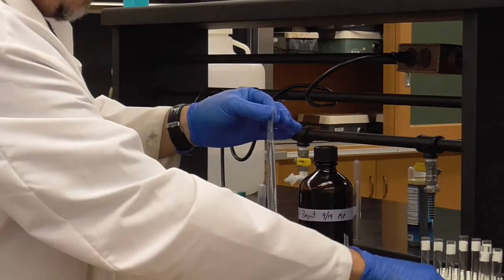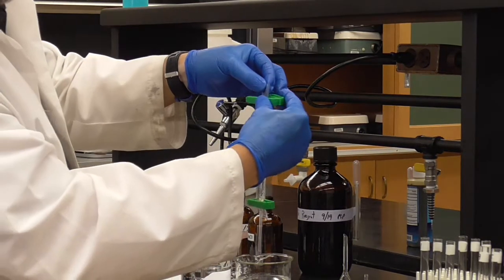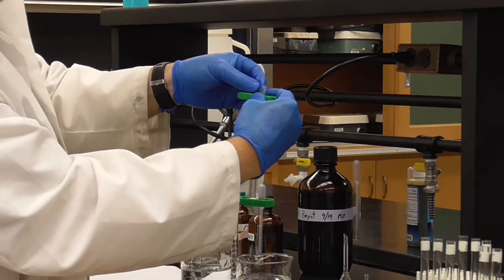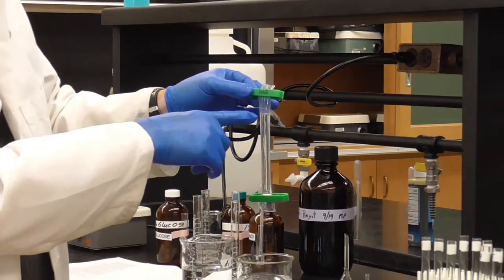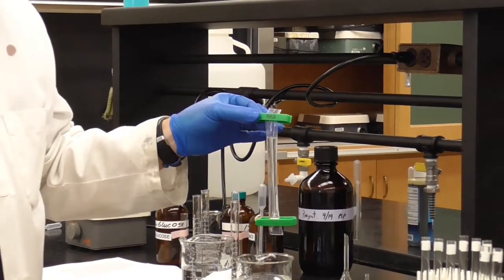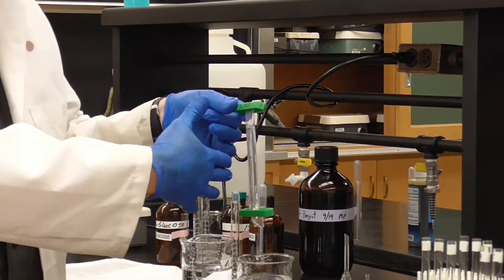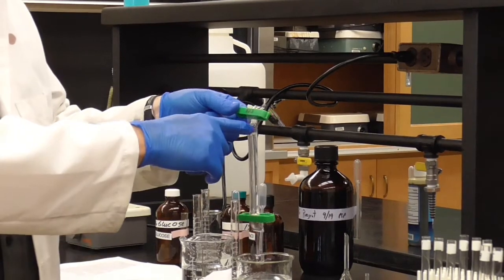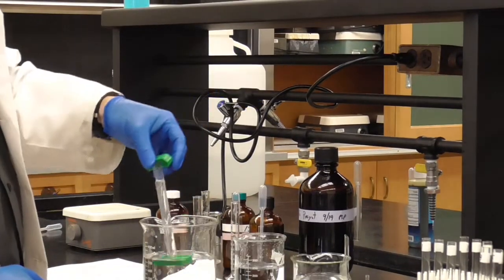All right, our second clip, I'm going to take it and put it near the top and clip it on. So there we go. Now we've got both the top and the bottom sealed. Notice I didn't put it right there at the top of the solution either. Very often with osmosis, extra water will actually go in and enter, and if you don't leave a little extra space up there, this will actually burst open. So now it'll fit better.